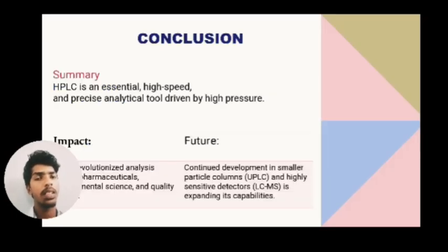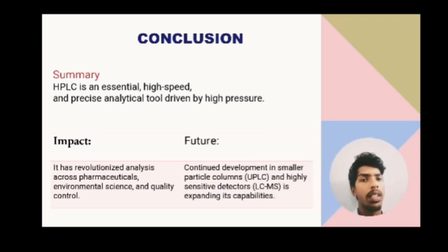Last one is the conclusion summary. HPLC is an essential, high-speed and precise analytical tool driven by high pressure. It has revolutionized analysis across pharmaceutical, environmental science, and quality control. Future: continued development in small particle columns (UPLC) and highly sensitive detectors (LC-MS) is expanding its capabilities.